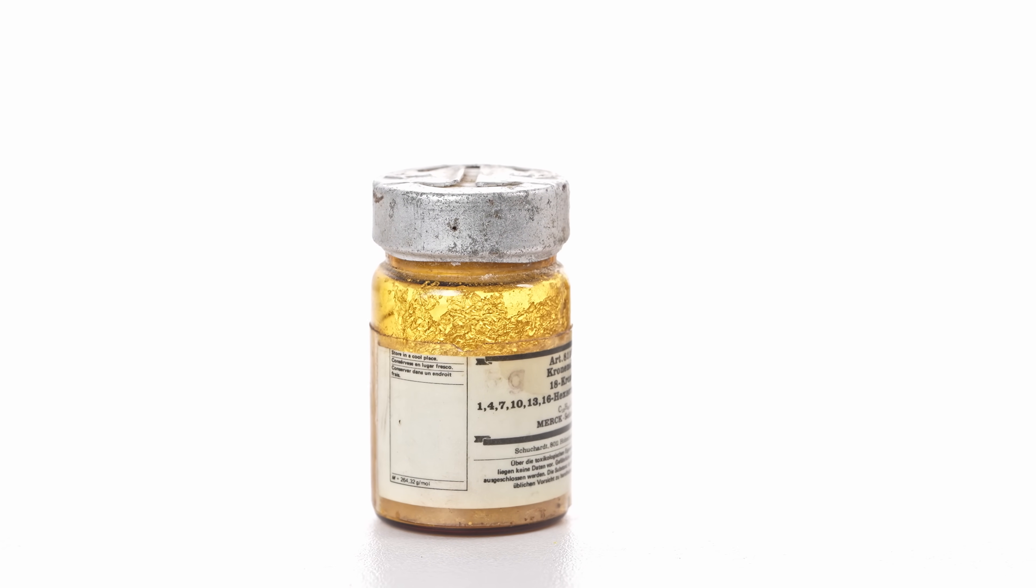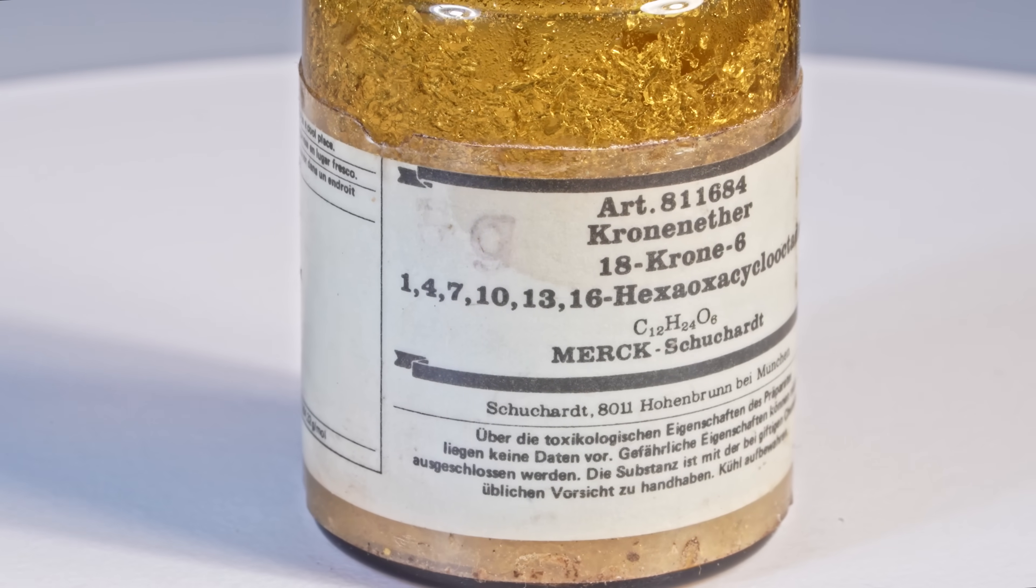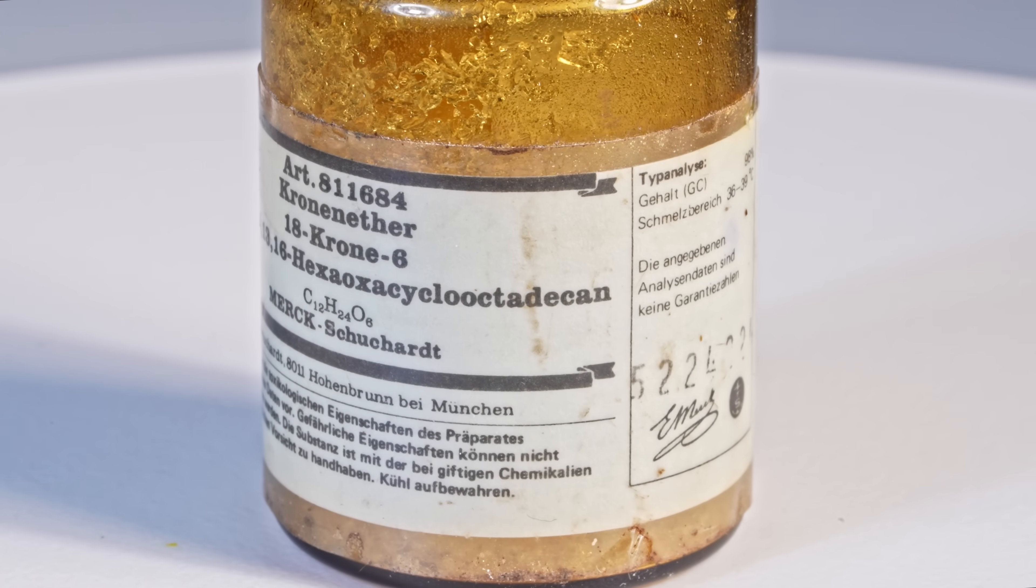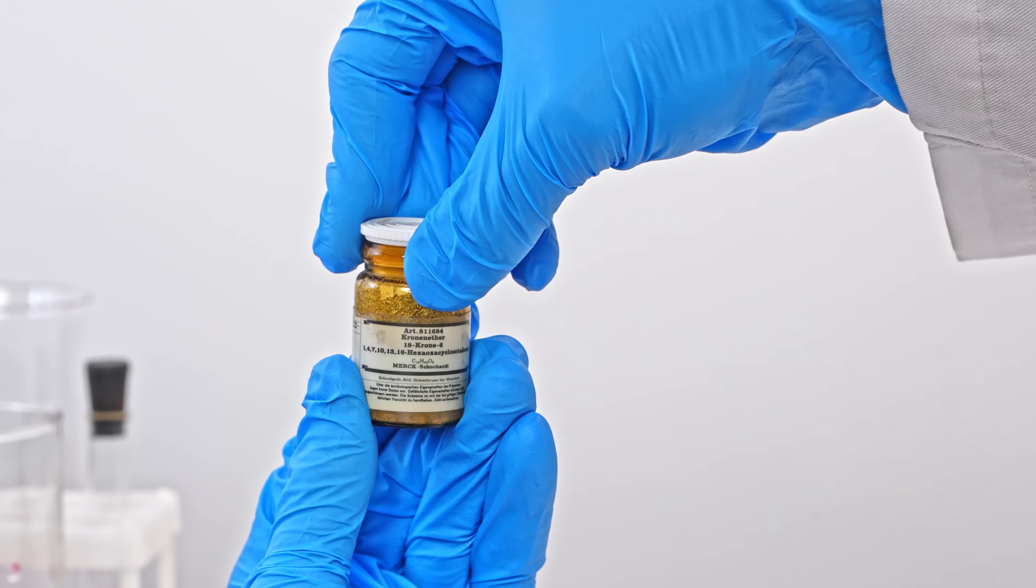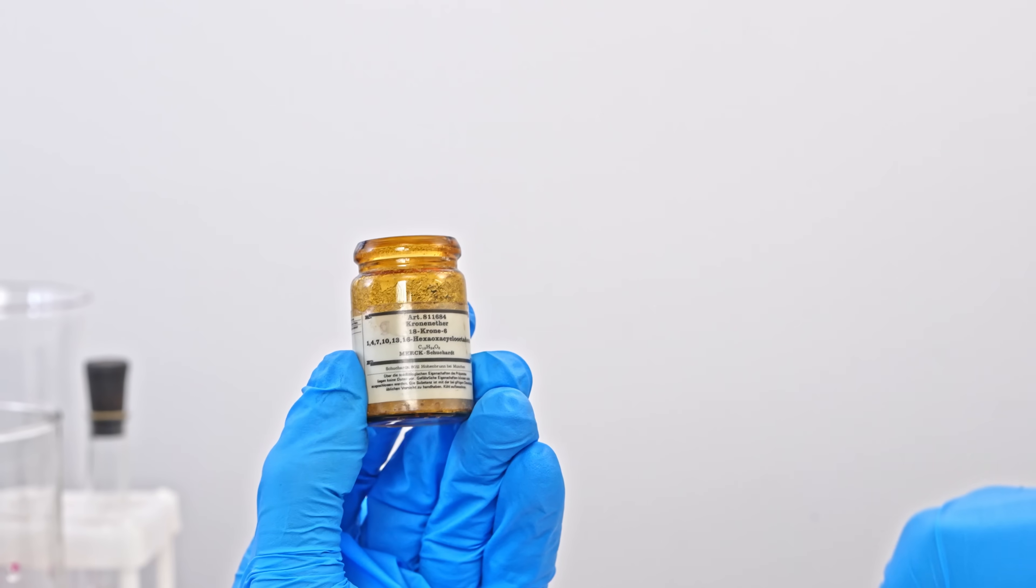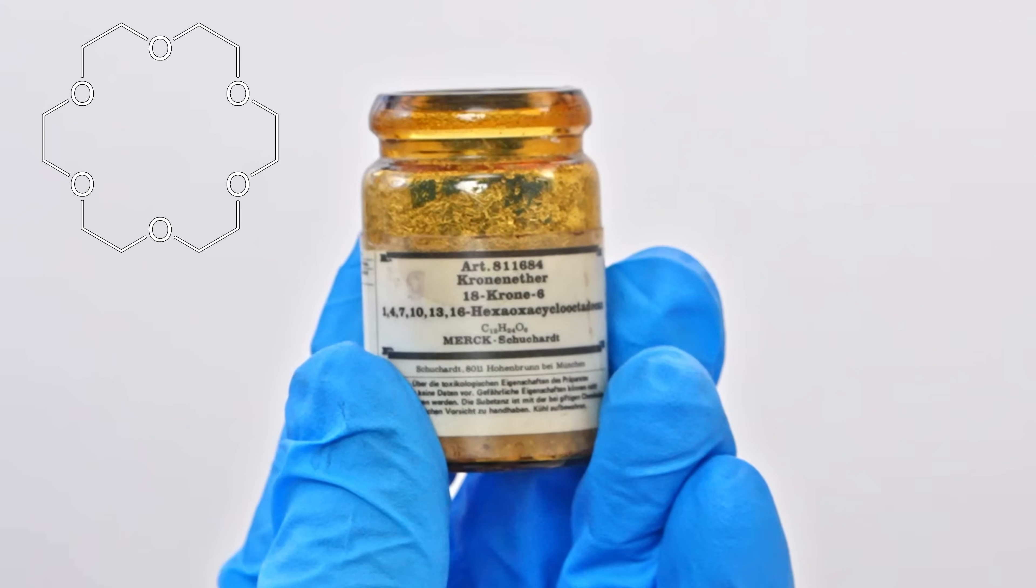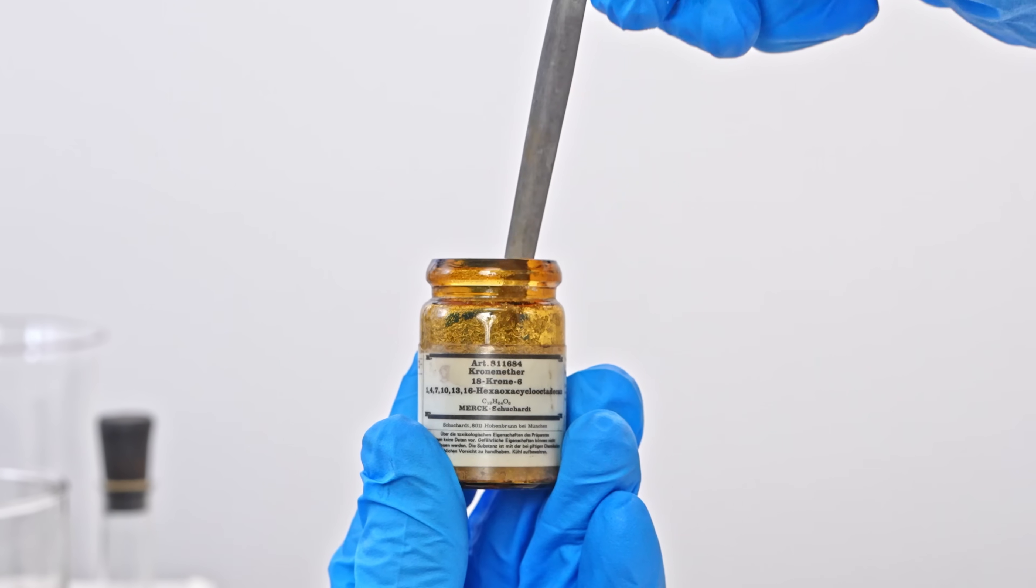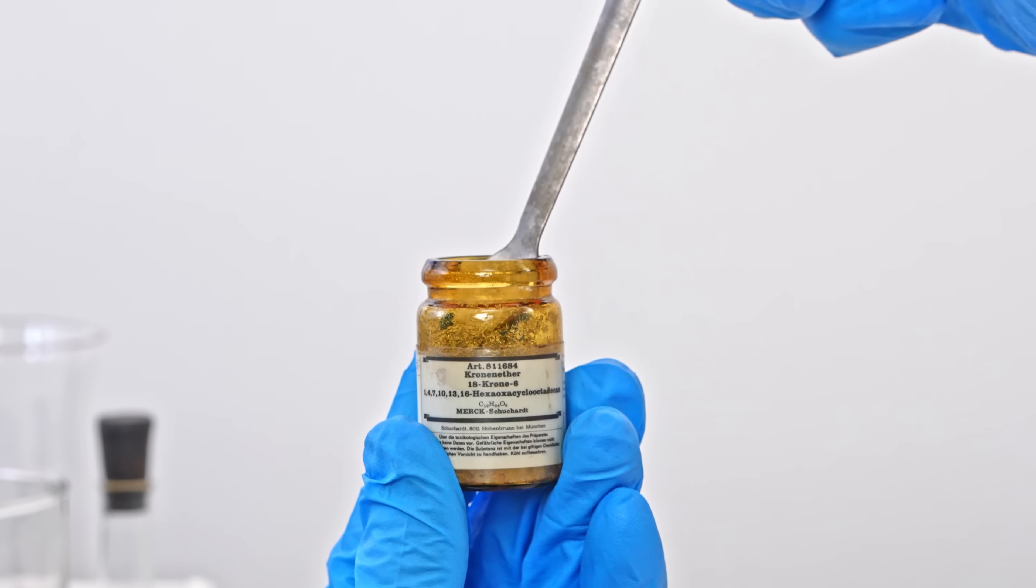However, we can make it dissolve in benzene using a special compound called 18-crown-6. This organic compound, which looks like transparent crystals, is a crown ether, a cyclic ether with six oxygen atoms arranged symmetrically.